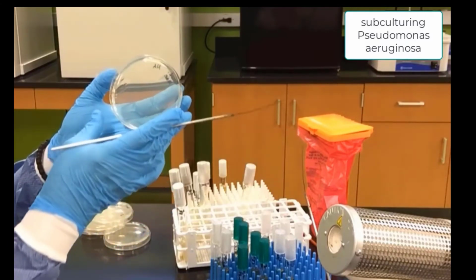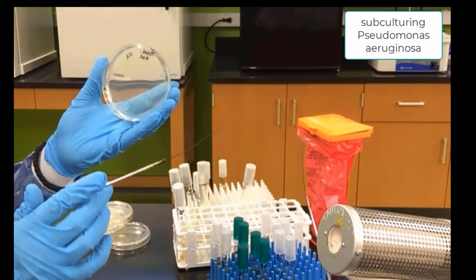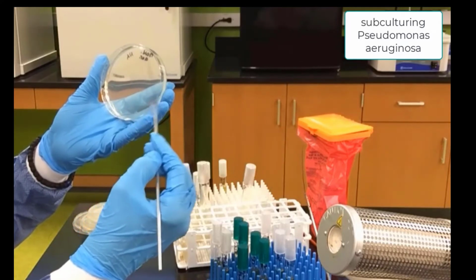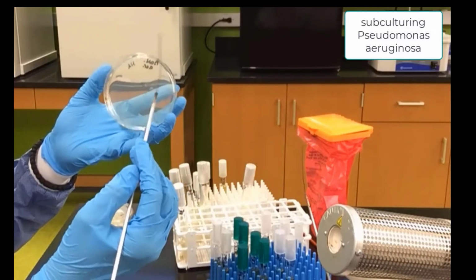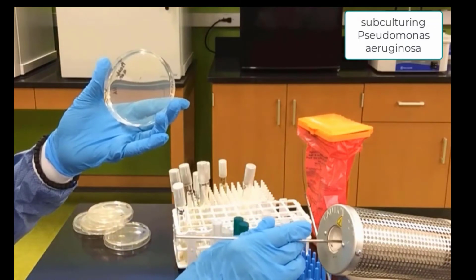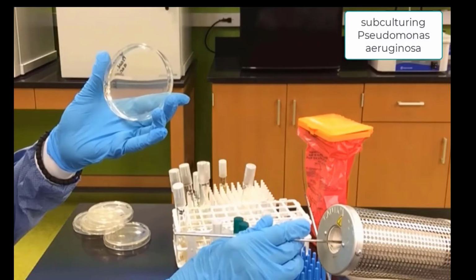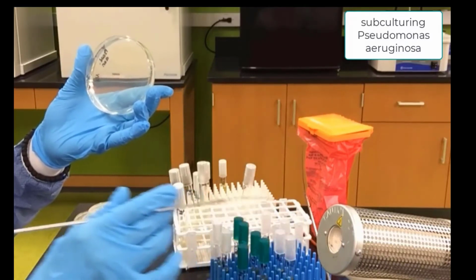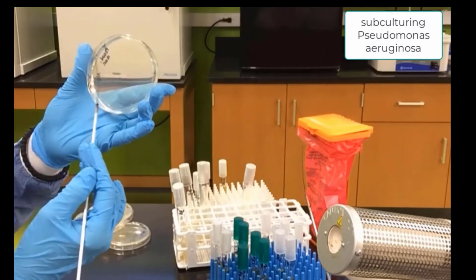This allows for the bacteria to get fewer and fewer as they grow over 2 days, and our goal is to eventually, after a 3rd streak, to get colonies. You hear the 2nd streak, zigzag and we stop at a certain point. We turn the plate 90 degrees and we sterilize the loop for about 10 seconds. Want to make sure we cool the loop. We do not pick up any new bacteria between streaks.